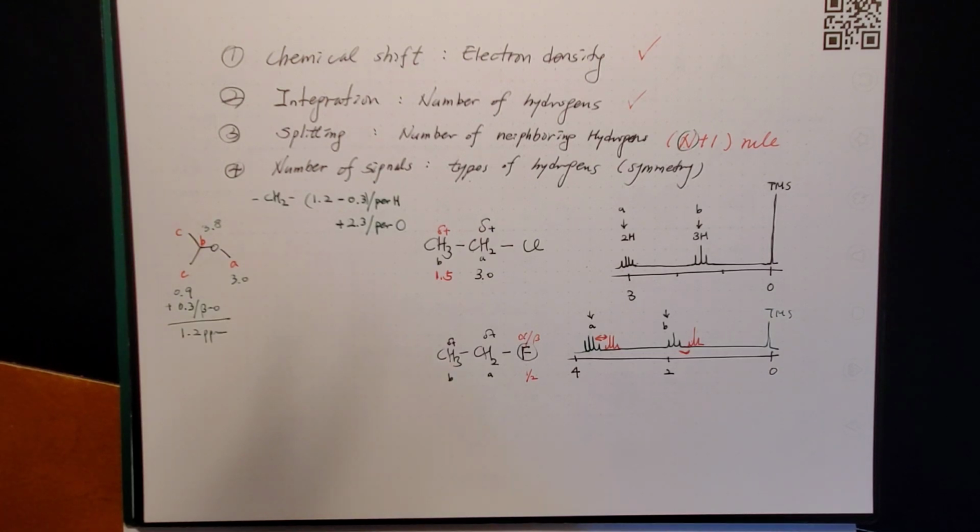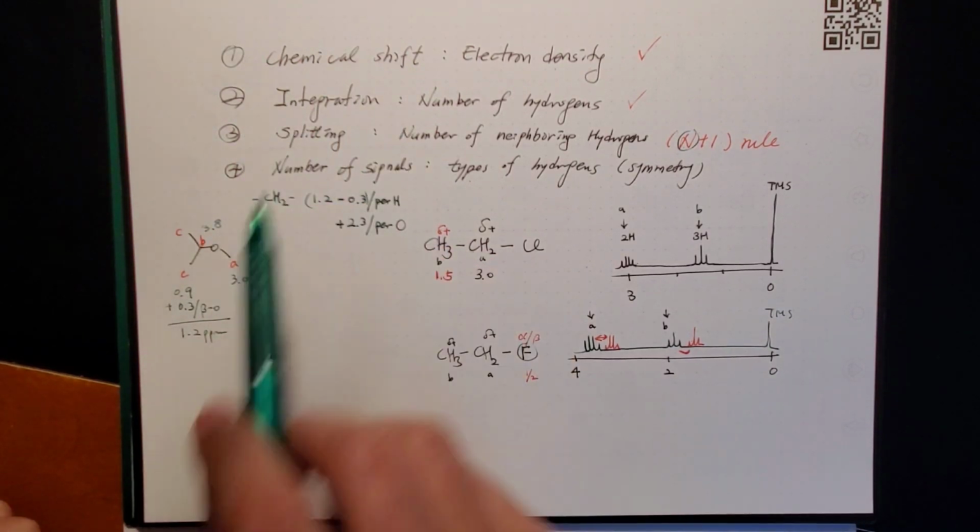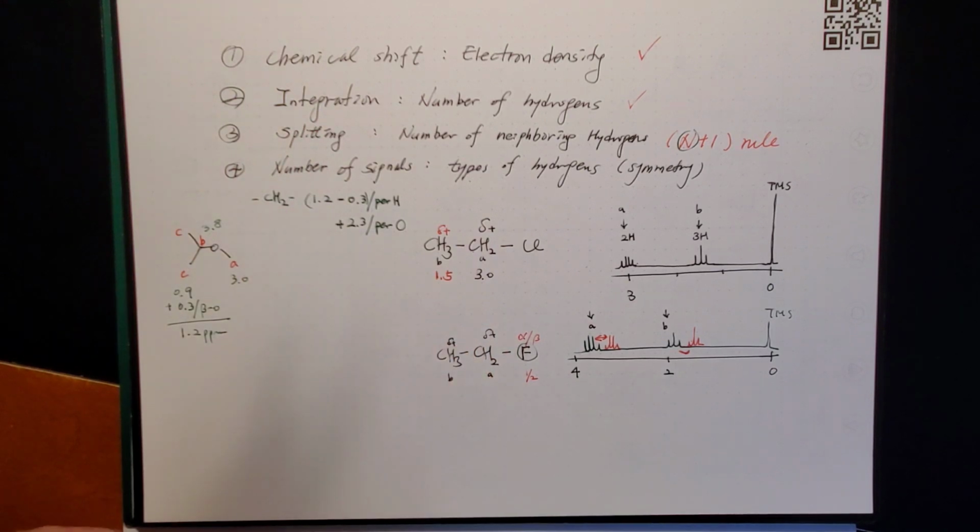But because NMR is relying not only on the chemical shift, but other things as well, your dependence on the chemical shift is not as serious as other spectra like IR. Okay, IR, you only rely on X number, then you add some of the things like intensity, Y value, or shifting.